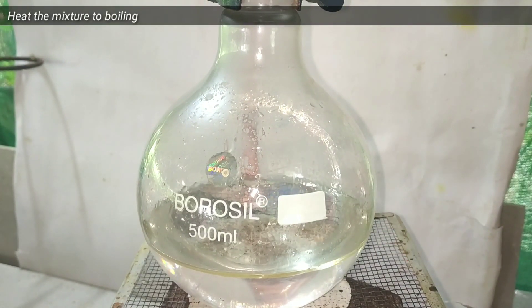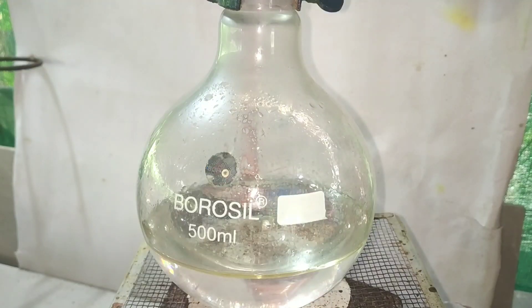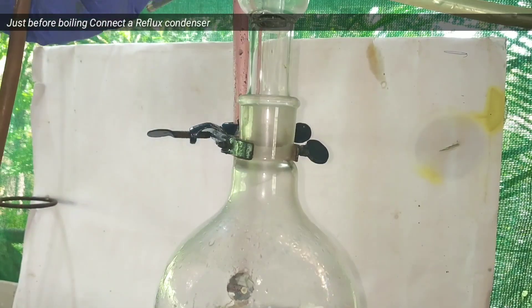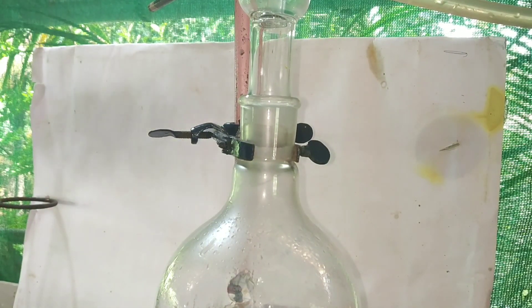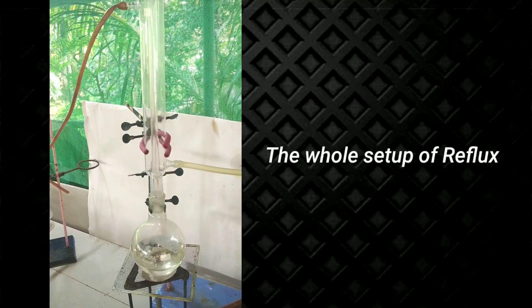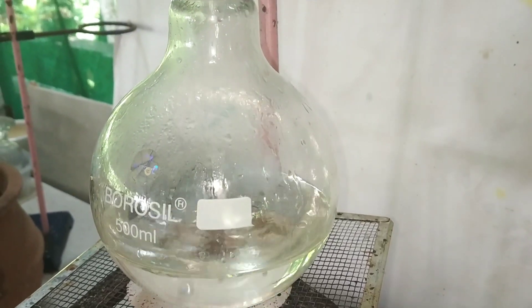Now we start to heat the flask using a Bunsen burner flame. When the mixture is about to boil, fix the reflux condenser on the mouth of the round bottom flask and reflux the mixture for about 15 to 20 minutes. This is the whole setup of the reflux mechanism — I have fixed the reflux condenser and attached the water inlet and outlet.